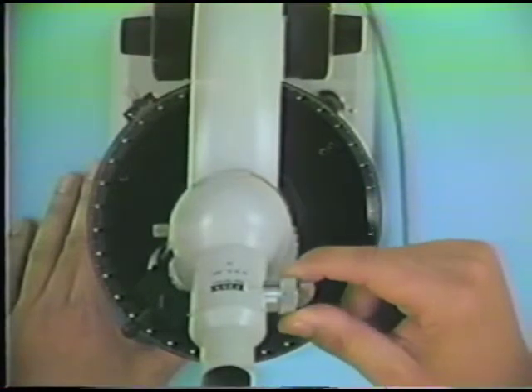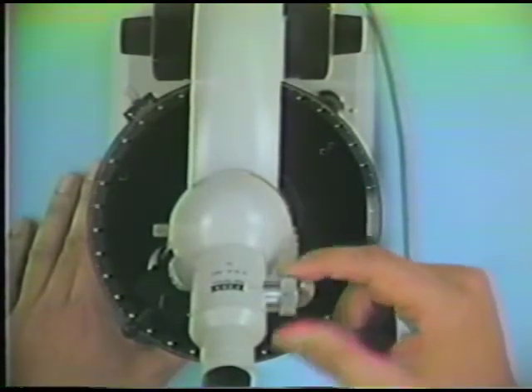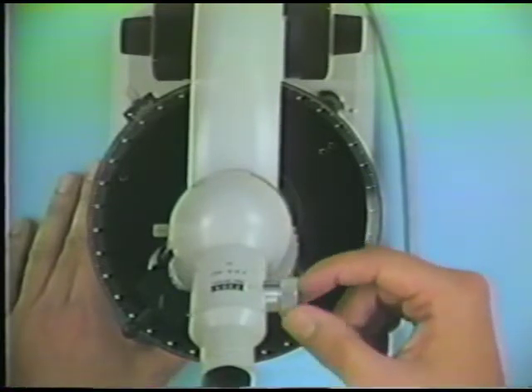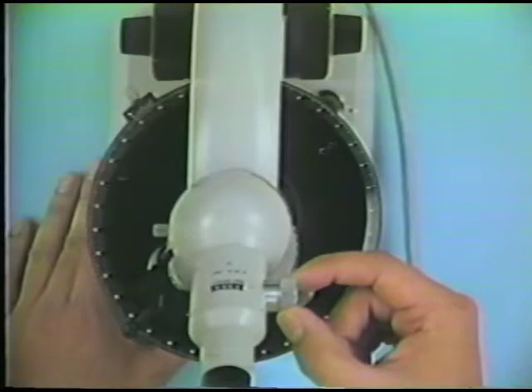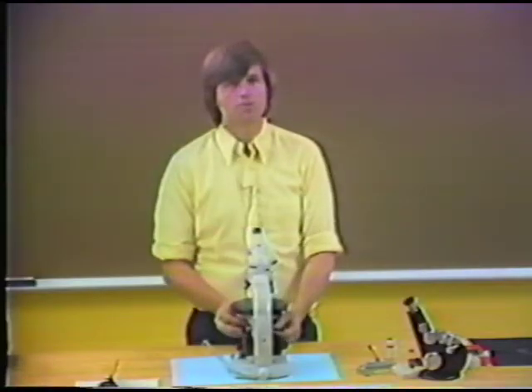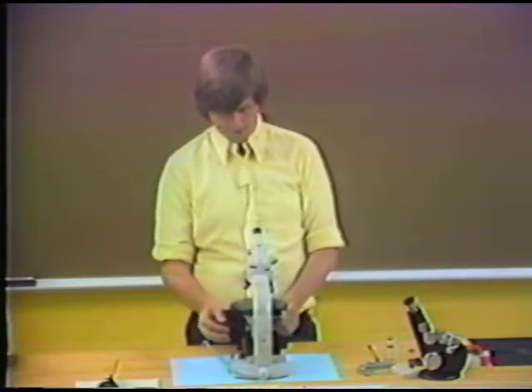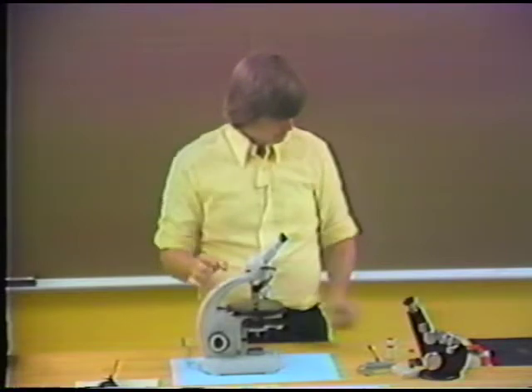And we use the Bertrand lens in conoscopic view. We do not use it in orthoscopic view. So if we set up for orthoscopic view, we have our specimen, we have our Bertrand lens out, we have our converging lens located below the stage, also in the out position. So we get our microscope set up this way.